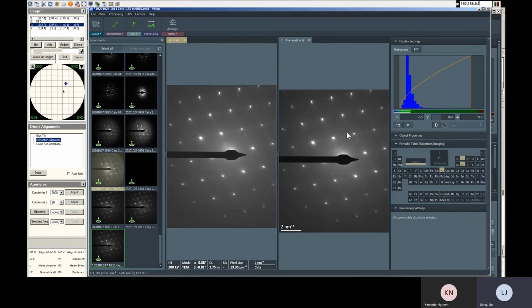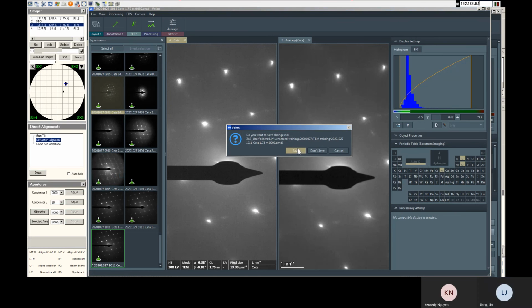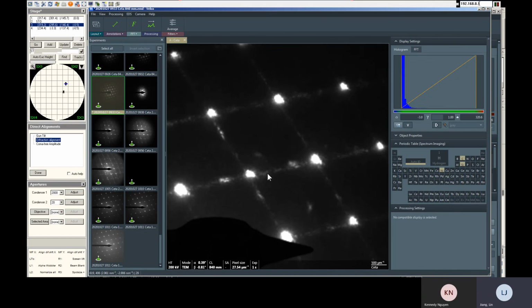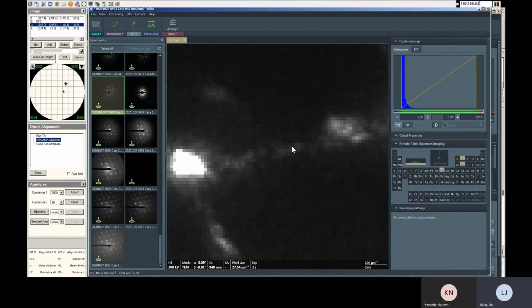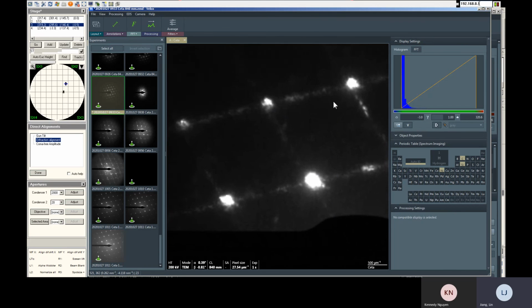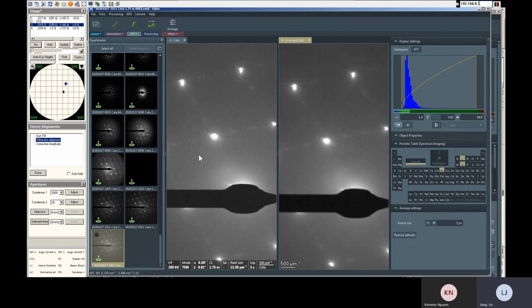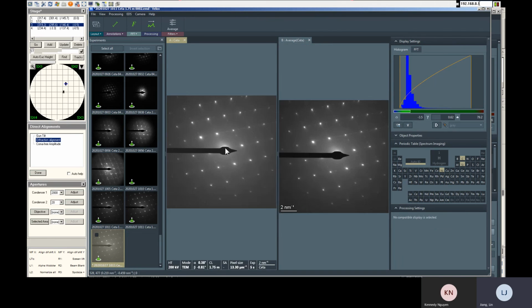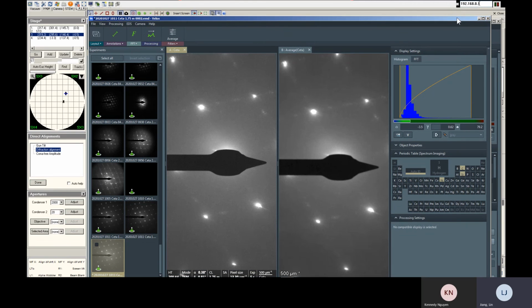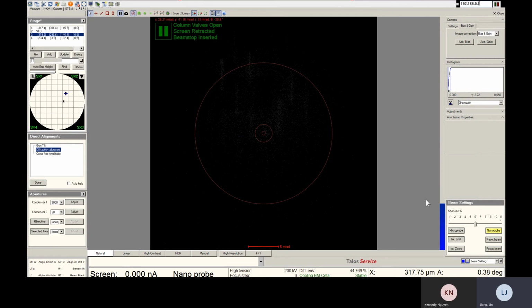This is a good nano diffraction pattern. Compare with the microprobe one. In the microprobe one, you're still seeing some, but it's not clear. In the central one you see a line, but you don't see a clear separation of the spots. But here it gives you more separation. Definitely, if you further reduce the spot size, it's going to give you more.